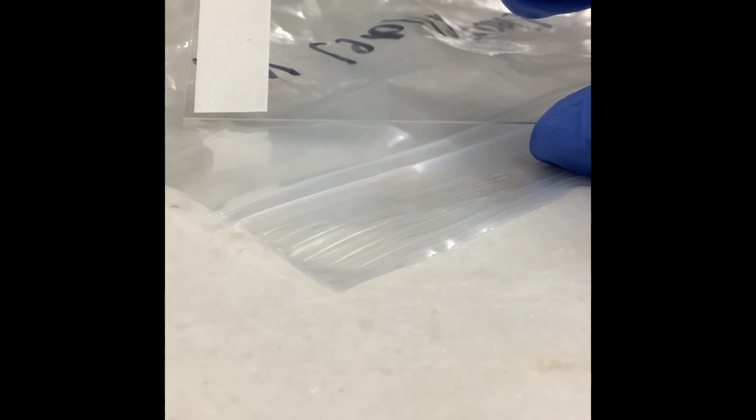I put this little piece of tape over here so that I can label them. Sometimes I also label them beforehand if I know the names of my samples, so I just put sample name and then the date I acetolyze them on the label. And prepping all of these ahead of time makes actually putting the samples on them much faster and much easier. And then a few things about your clean slides.